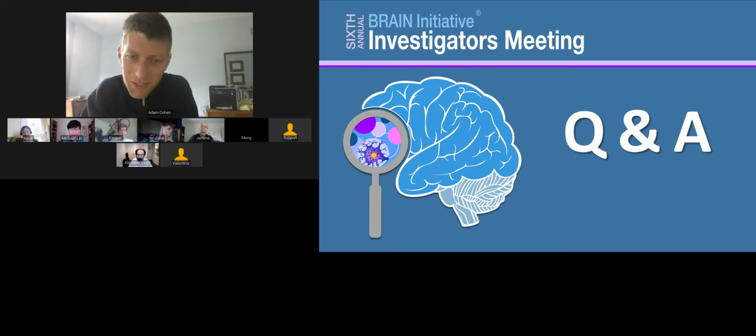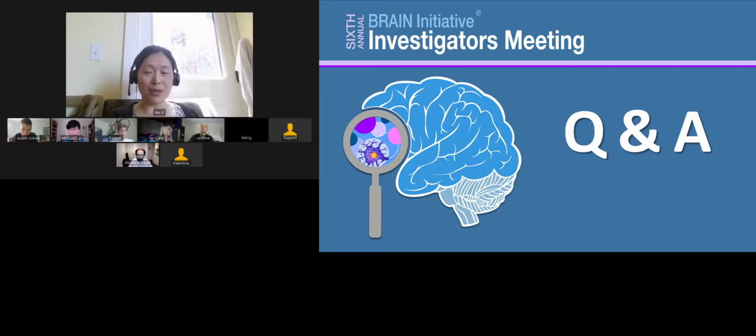Since you answered the last question, maybe you want to tackle that one first? Yeah. So with FACET, we do have a very high data rate, and it would be great if we could all have the same kind of data pipeline. But practically, just like in all the different methods described here, we are taking data in very different ways. For Jerome's case, it's going to be at different depths, and in my case, it will be at different lateral positions. So in the initial stage of data analysis, I do not see how a universal pipeline would apply to everybody.